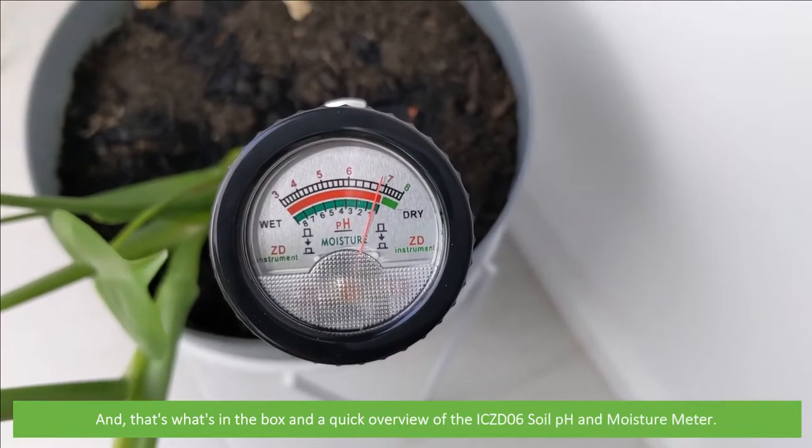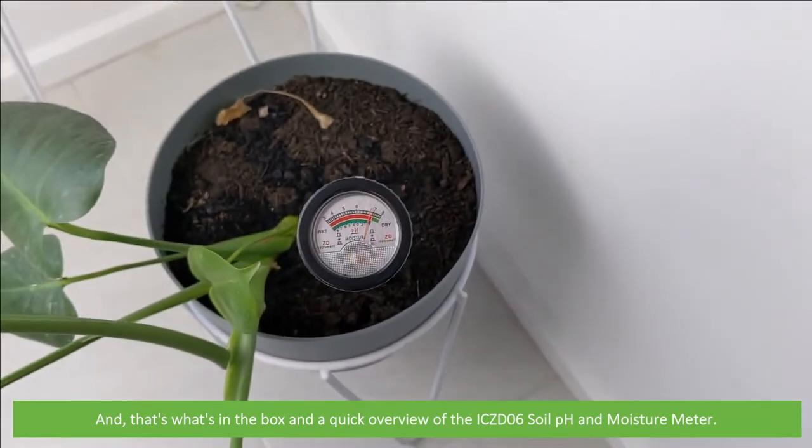And that's what's in the box, and a quick overview of the ICZ-D06 soil pH and moisture meter.